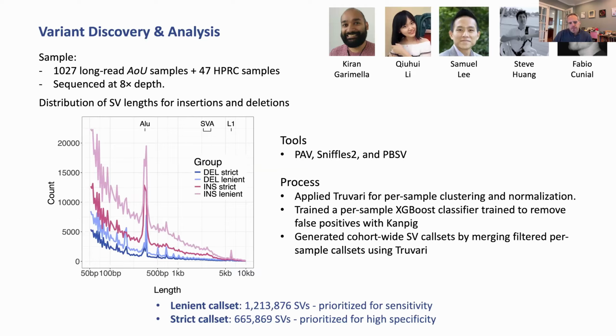There's some very old theory that goes back to the original Human Genome Project, the so-called Lander-Waterman statistics, that says at 8x coverage, we're going to get more than 99%, 99.9% of the genome resolved. Because of that, we get excellent variant calling on a per person basis. And then using the latest and greatest machine learning technologies and merging technologies, we can get pristine population cohort variant calling through these data.